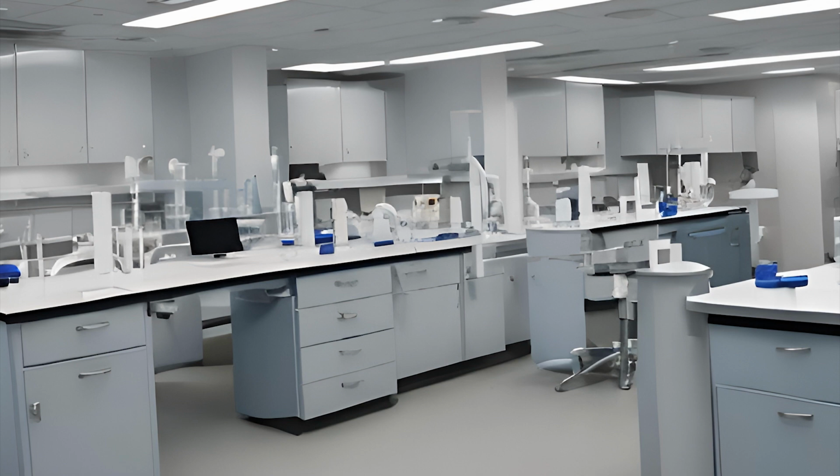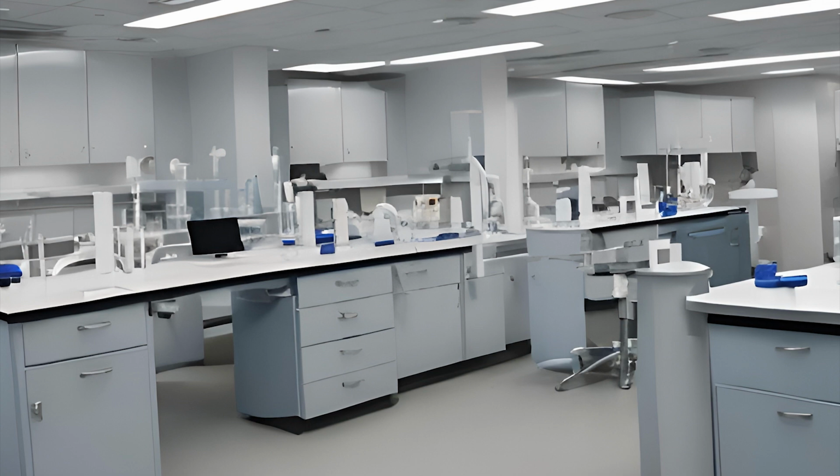You can also have issues with centrifugation, failure to separate the fluid from the cells, incomplete centrifugation, or incorrect centrifugation settings. Oftentimes you'll see failure to separate fluid from cells if somebody spins a tube down too early. If you've got a tube that's supposed to clot and it hasn't finished clotting yet, and someone centrifuges it anyways, you won't get a full separation of the fluid from the cells. Another error that can occur during specimen processing is mislabeling an aliquot. Again, mislabeling is the worst thing that you can do in the lab. Above and beyond running the wrong test, mislabeling is what hurts people.